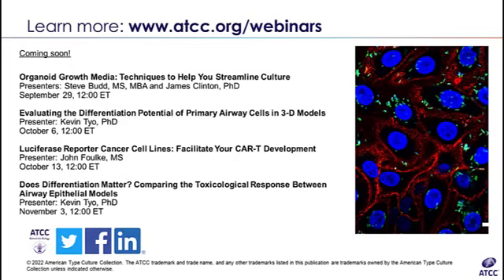No, you basically covered it. Especially when you're working in a biosafety cabinet, the glass should be below your breathing level anyways. So the risk of you breathing in the biosafety cabinet should be low. And again, the flow rate, like Steve alluded to, should hopefully preclude any of your breath getting inside the biosafety cabinet if it's calibrated correctly. Yeah, that's what I thought as well.